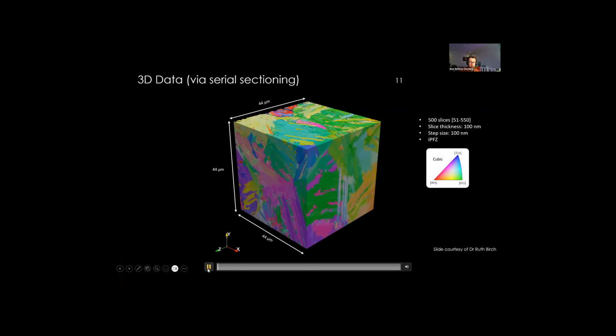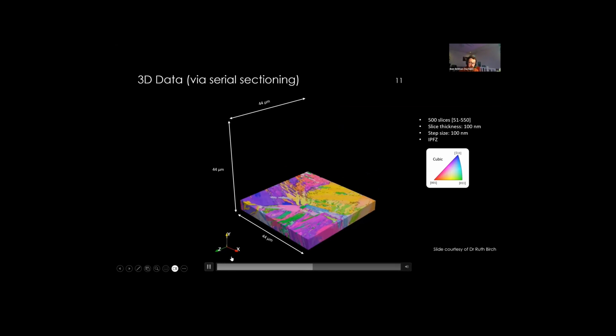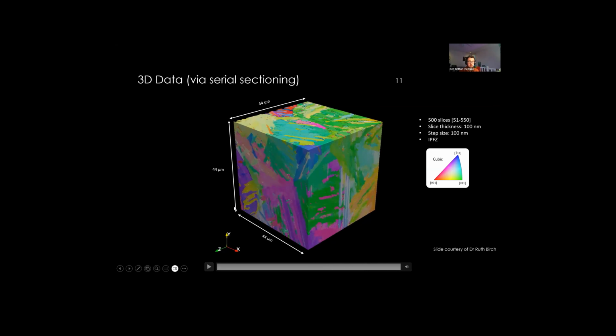This is a vast steel sample, and so we can see the slice and view type visualization that shows us the microstructure, and you can imagine the sort of problems that we're interested in. What are the interfaces that are present, and how do they represent themselves in 3 dimensions? This is a relatively small data set that's behaving itself. We're getting up to 250 to 500 micrometer volumes, which is really starting to be powerful for our steels microstructure problems.